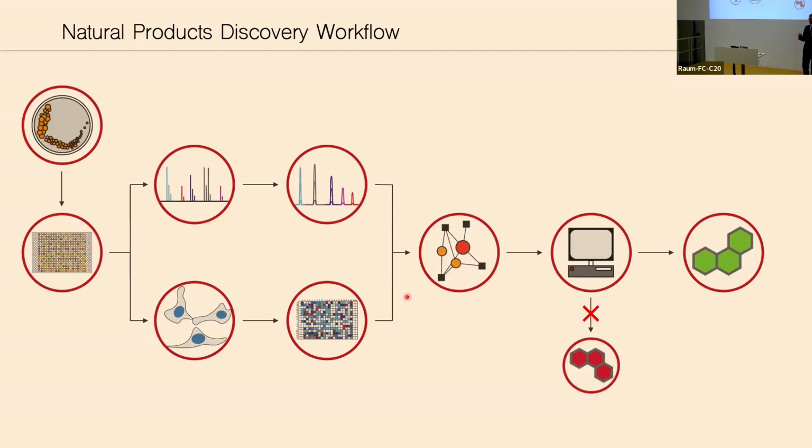So we became interested in systems approaches. Rather than studying the chemistry at the end, where you pick your extract of choice and work iteratively through to identify molecules, why not look at the chemistry of the set on a much broader scale at the beginning, and then draw inference about which molecules are worthy of your attention early in the process? That way you focus that dedicated and complicated chemical effort on molecules most likely to be of value. That led to us reversing a lot of the workflows that we pursued, and it meant that we started to study samples on scale. A typical experiment might involve 1,000 extracts.